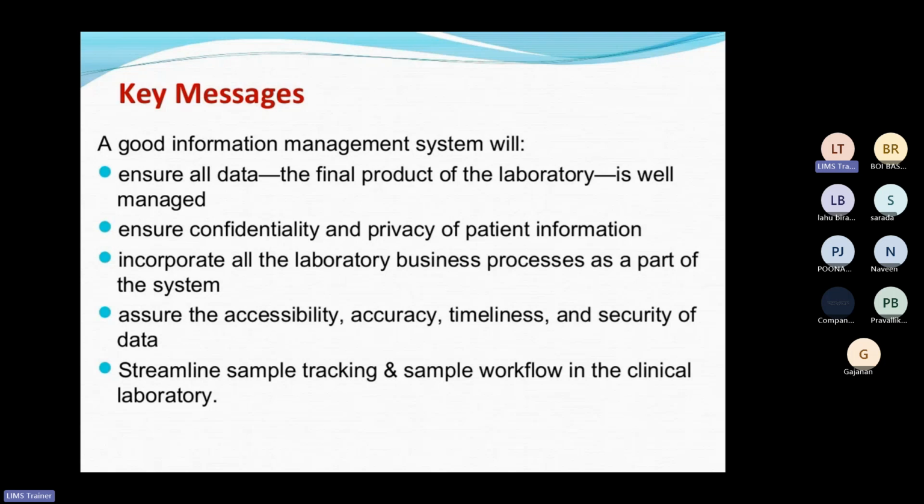Also the accuracy. Suppose different instruments are integrated with the software, starting from HPLC to weighing balance. Accuracy means whatever, suppose 1 mg weight is shown on the weighing balance, the same should be incorporated into the software, right? There should be no change, and 1 mg should not be shown in some different decimal. That is how the integration will be there, and that accuracy is required inside the software. Then it will be good information management.